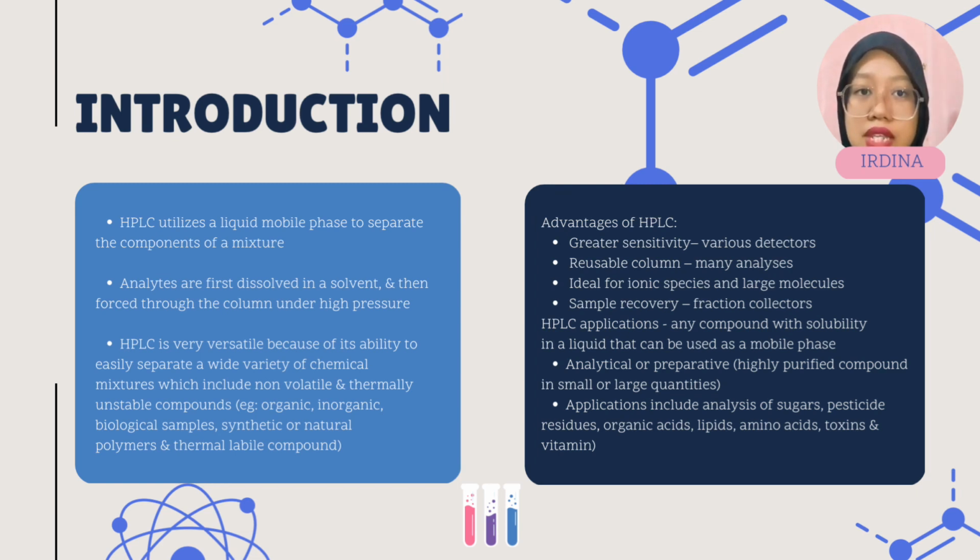We have 4 advantages of HPLC. First, greater sensitivity, various detectors. Second, reusable column, many analyses. Third, ideal for ionic species and large molecules. And the last one, sample recovery, fraction collectors.